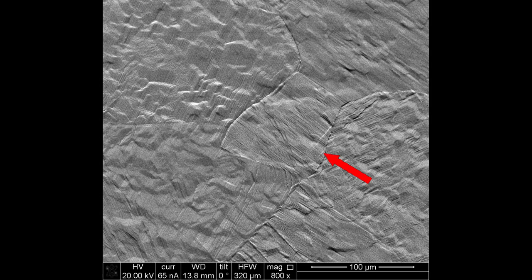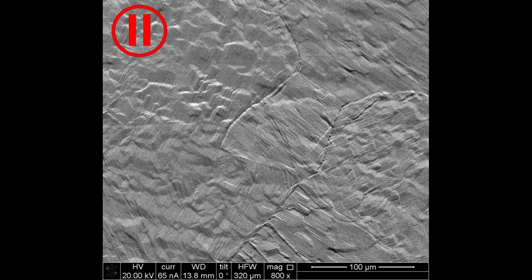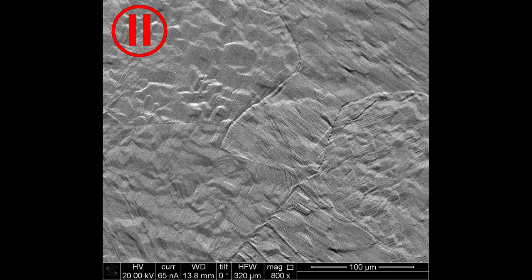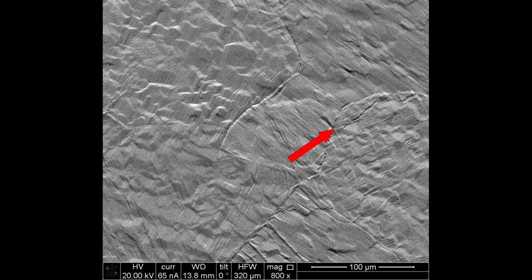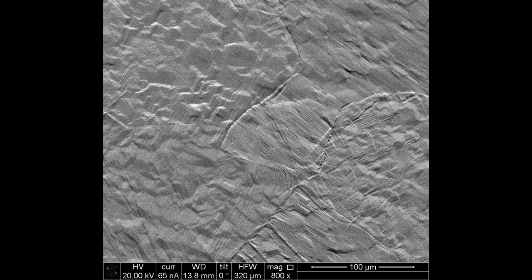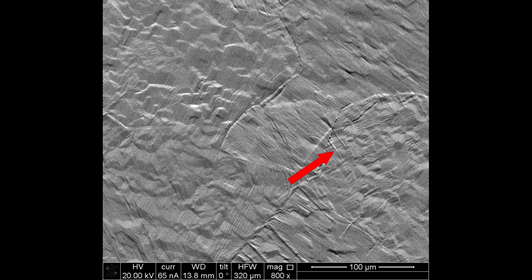Next, another lath about 30 microns down from the first nucleates. This appears to be a result of autocatalytic nucleation, where the first lath produces a strain field that can be relaxed by a second lath of the same orientation nucleating further away from it. Another lath then nucleates at the same point as the first on the opposite side of the beta grain boundary, and then autocatalytic nucleation continues on that side of the boundary.